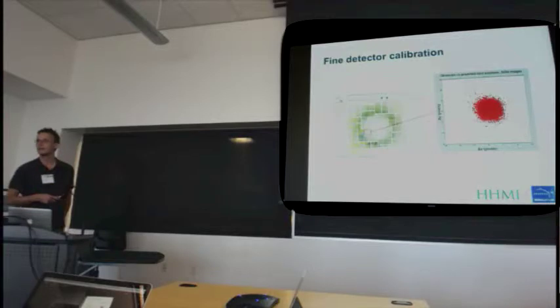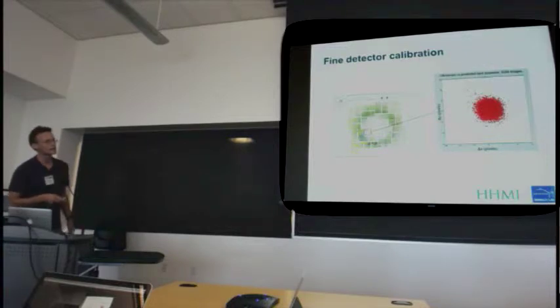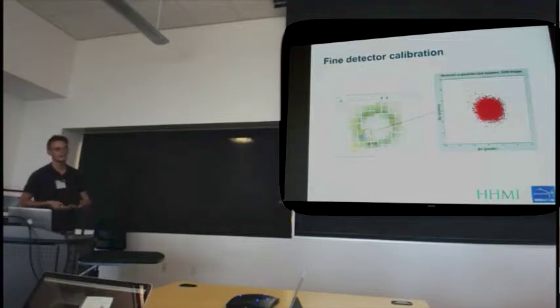And again, you've seen the slide before, but what we did next then is to take these images, index them, and then compare. Where are the observed spots, and where does the indexing algorithm predict that this spot should be? And do that for lots and lots of images, and look at the residuals, the vectors for any one particular element of the detector. This one chosen there. We can see that, and you get a scatter plot. And it looks pretty good in this case. Maybe one should have moved this whole little element a fraction of a pixel to the left. But doing this analysis, those were the kind of corrections that we could apply after that.